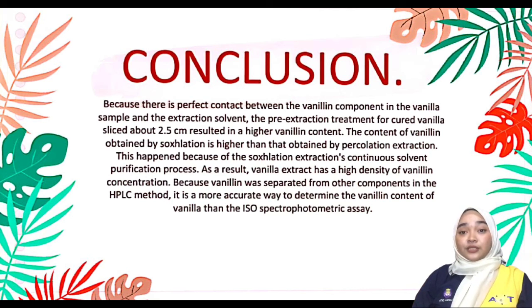Because vanillin was separated from other components in the HPLC method, this proved that the HPLC method is a more accurate way to determine the vanillin content of vanilla than the ISO spectrophotometric assay.